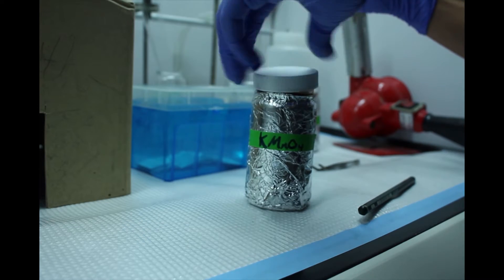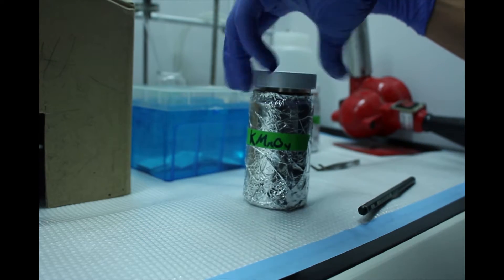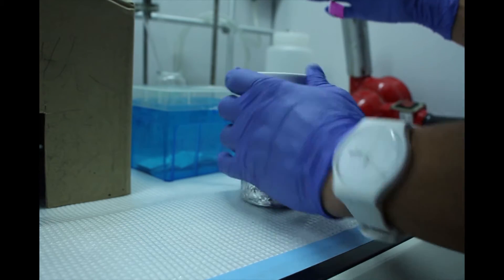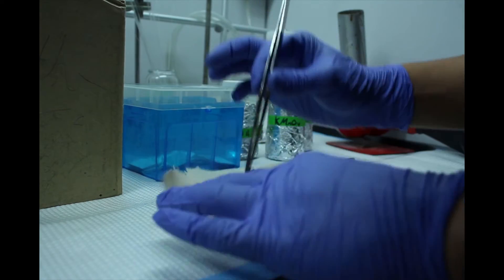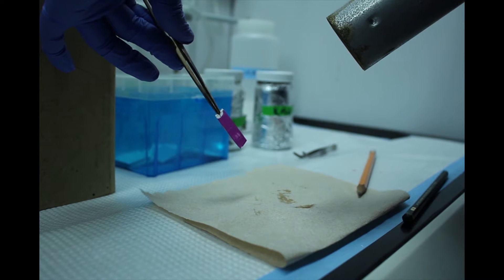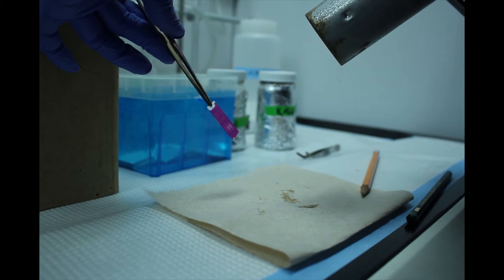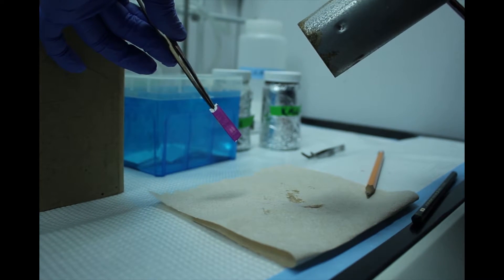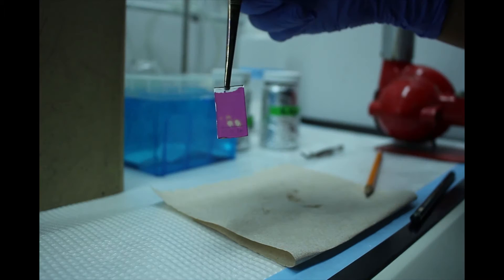Using tweezers, submerge your entire TLC plate within the potassium permanganate solution. Wipe excess potassium permanganate stain onto the paper towel and begin to heat the plate. You will see yellow and or light purple spots form. Heat the plate until you can see all of these spots clearly.